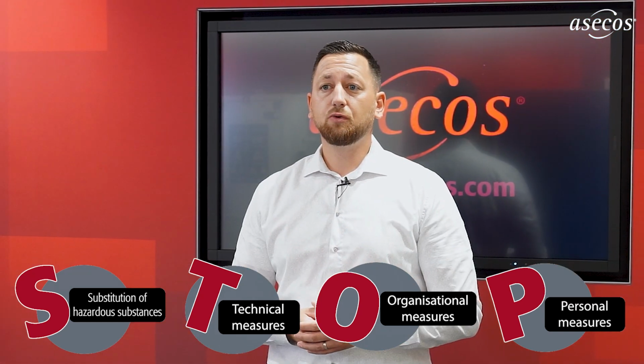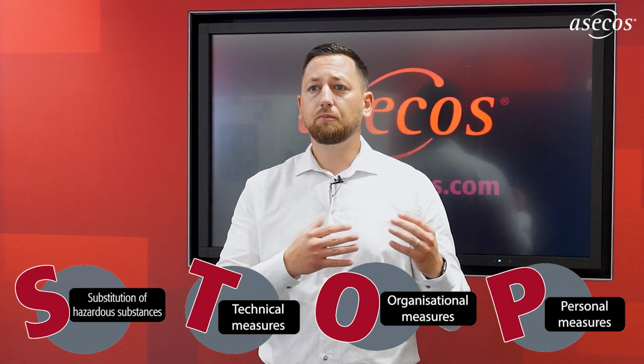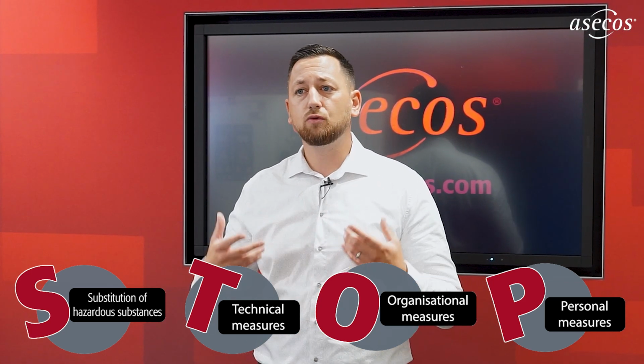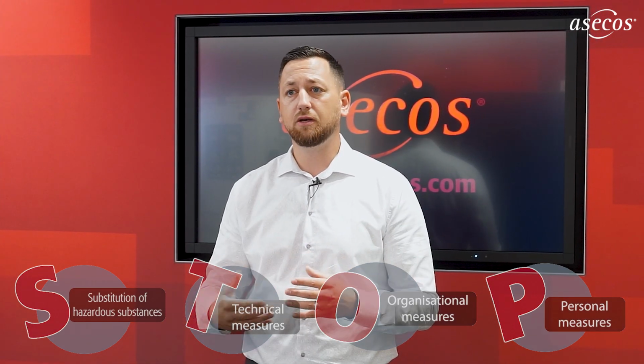P are the personal protective measures. Only if the previous measures are not sufficient is personal protective equipment such as protective clothing, goggles, or respirators used to minimize the remaining risks.